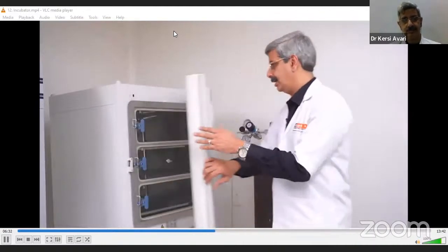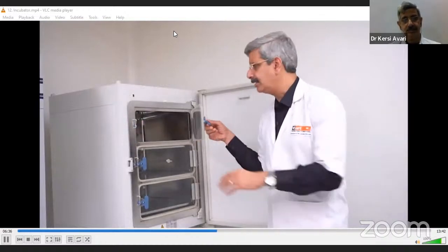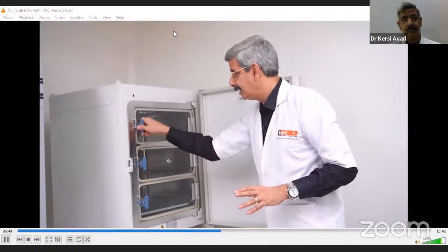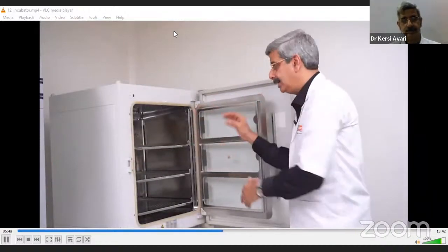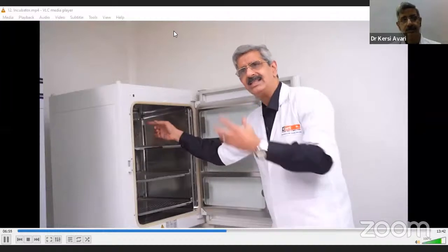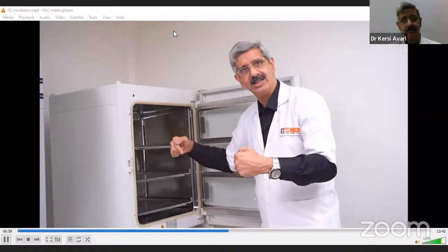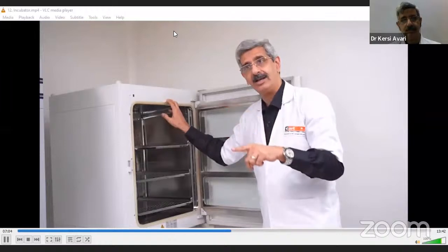Now the inner parts. As you see, this is a multiple door for the facilitation of keeping our dishes at various shelves. Ideally, the chamber inside is just a single one. These are fenestrated shelves. These are runners. There is a circulating fan. Inside there will be a filter. Then there are two ports for carbon dioxide, two sensors, one for temperature and one for carbon dioxide.